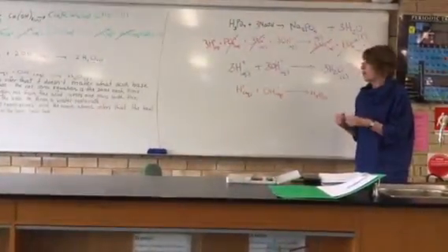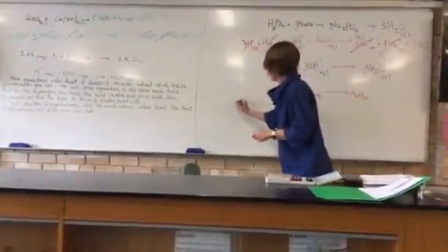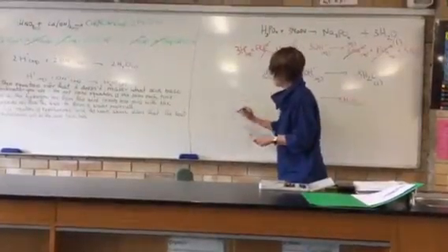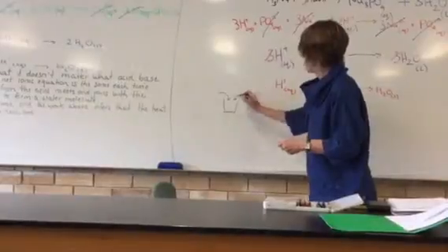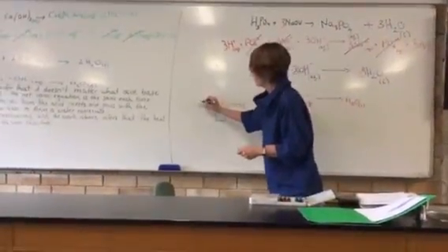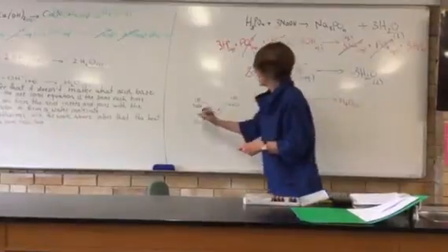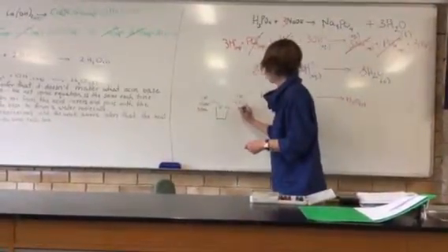And I'm wanting to go through the calculation to remind you how to do that. So in the prac work, you're going to get a polystyrene cup, and in that cup you're going to put your acid and base combination. I'll just choose hydrochloric acid and sodium hydroxide. That's one combination that can be used. To remove one variable, you're going to get a 1 molar solution of both. And we're going to put in equal amounts. So let's just say, for the sake of the calculation, we're adding 50 mils of each.